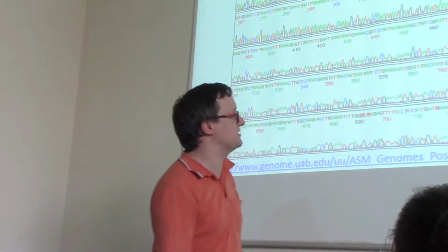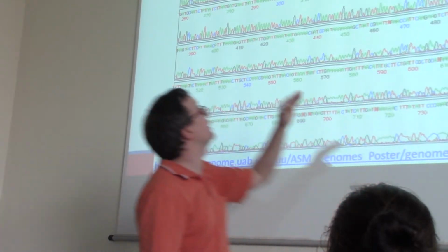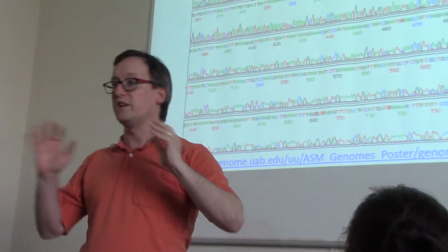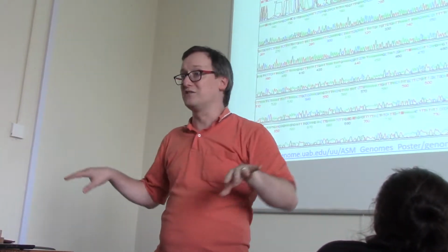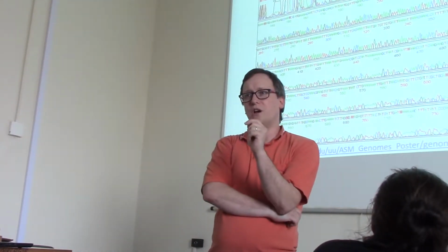Okay? That's a really basic kind of rule. We'd say anything past, I declare, 600 shall be trash, and anything before, let us say, 50 shall be trash, and we'll accept everything else. That's a discretization. It's separating these reads into the good and the bad, and everything else, and that's it, right? So it's a very simple-minded way to go.